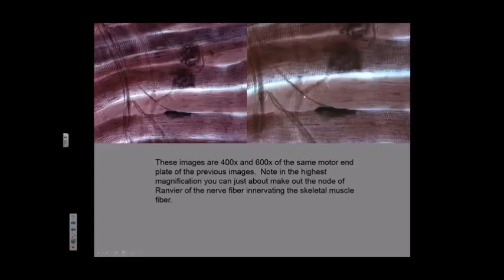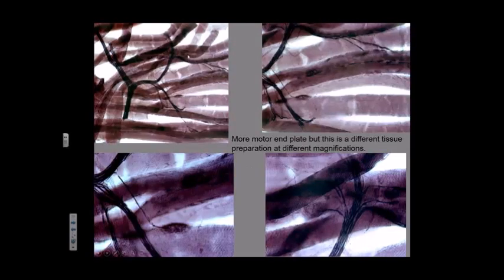And you can see from here to here is one Schwann cell. And between here and here, there and there, is a node of Ranvier. Then there's another Schwann cell, and then here's your terminal synaptic bouton. The bouton is a lot of little synapses. Here we're looking at it sideways, here we're looking at it down, and when it's down, you can see all the little dots. So that's the wiring of the skeletal muscle.